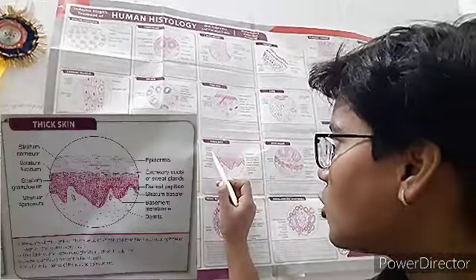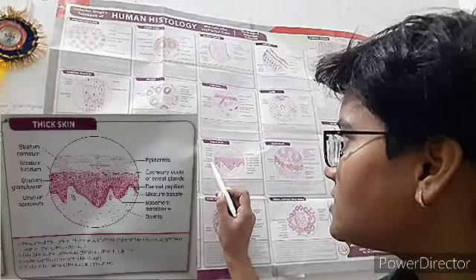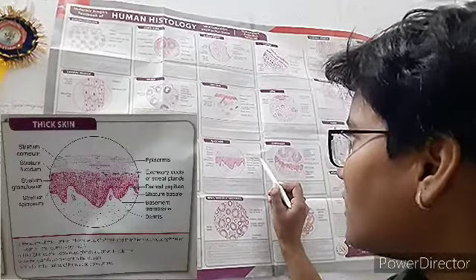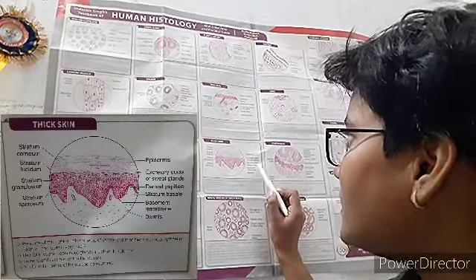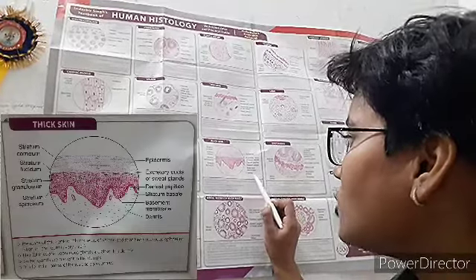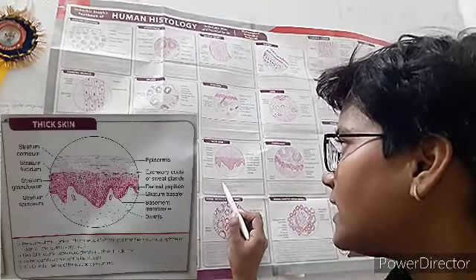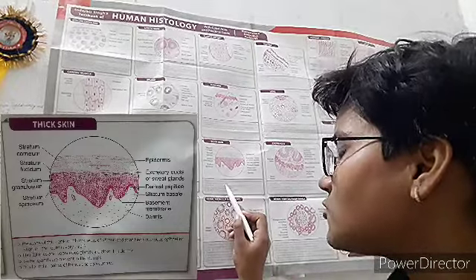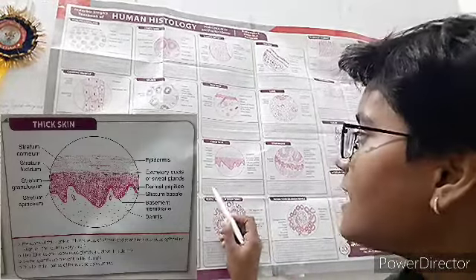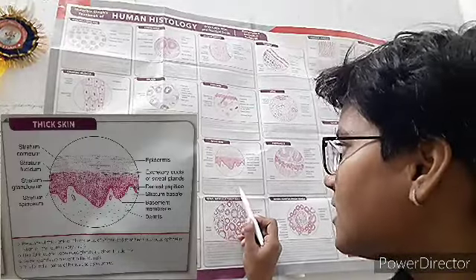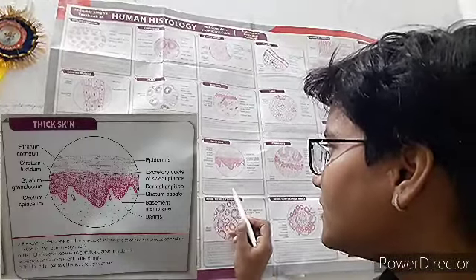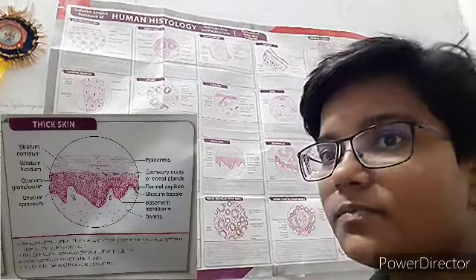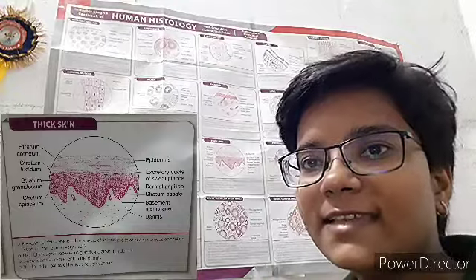Now thick skin. Visible structures include stratum corneum, stratum lucidum, stratum granulosum, stratum spinosum, epidermis, excretory ducts of sweat glands, dermal papillae, stratum basale, basement membrane, and dermis. Thick skin has a thick epidermis of keratinized stratified squamous epithelium, and the stratum corneum is very thick. Hair follicles and sebaceous glands are absent in the dermis; sweat glands are present. Thick skin is found in the palms of the hands and soles of the feet.